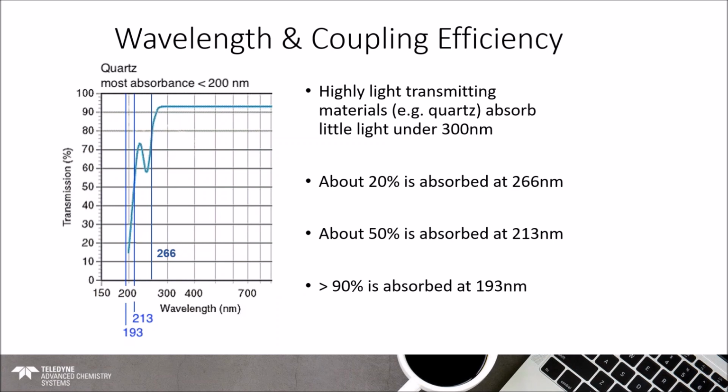That beam tends to go deeper into the material and kind of builds up until you get essentially a catastrophic ablation. That's still on a very small scale, mind you, but that explosion that occurs ends up robbing us of the cylindrical crater that we mentioned before as being our end goal. So in order to have the best controlled ablation, we want to have that narrower wavelength.